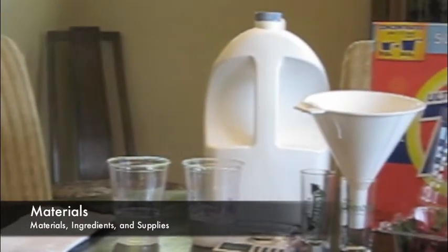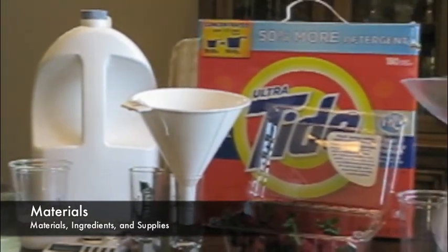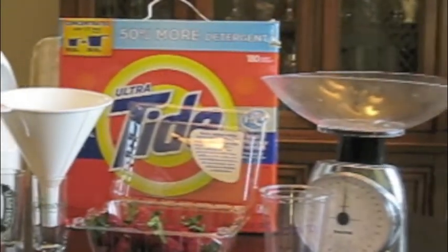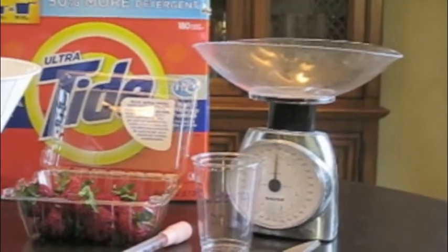Materials include liquid and powder detergent, extraction buffer, 2 test tubes, a funnel, strawberries, a milligram scale, a gram scale, rubbing alcohol, a pipette, and cheesecloth.